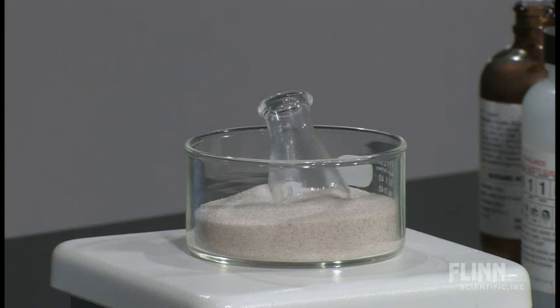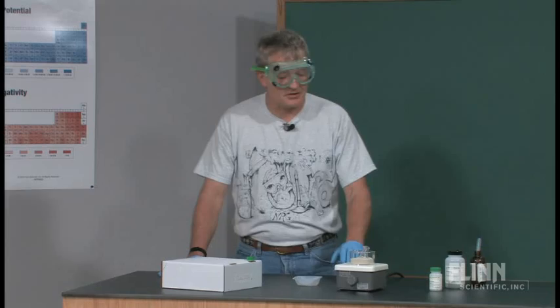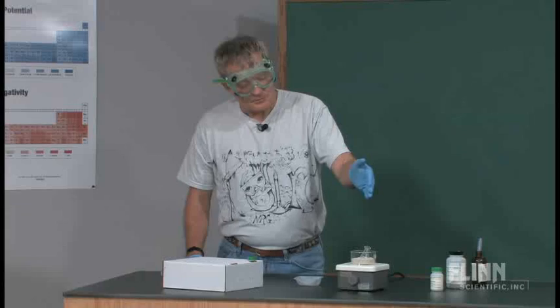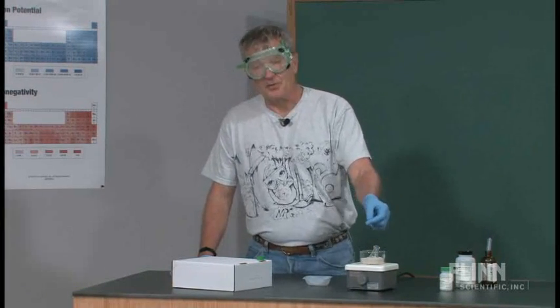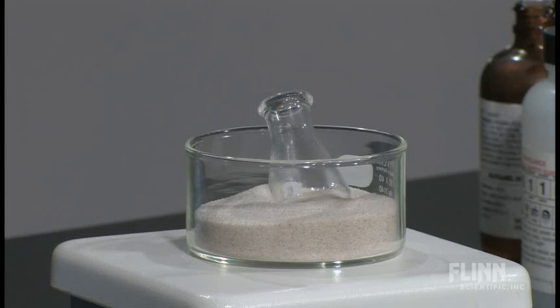But you need a way to deal with the vapors that are there and you don't want your students hanging over top of it. If you use an Erlenmeyer flask like we used here, a 10-milliliter one, you can put it into the sand bath directly.